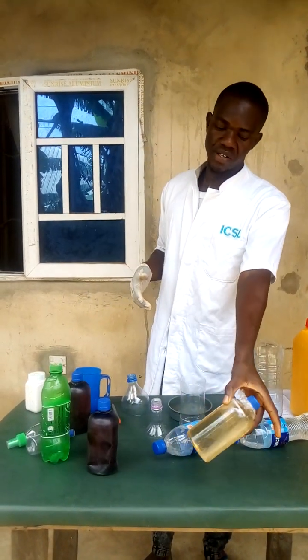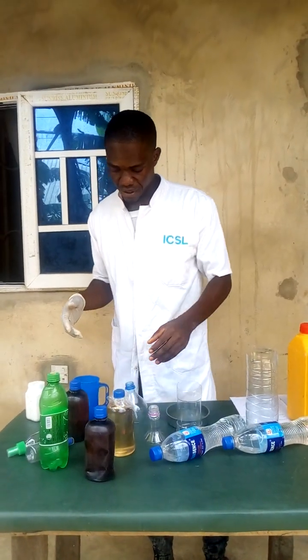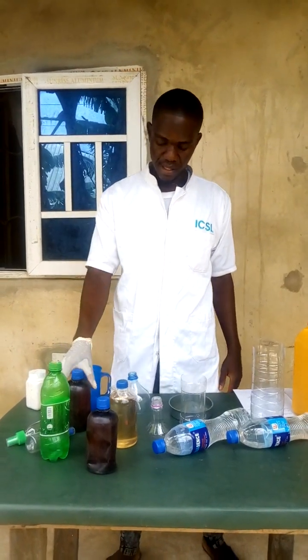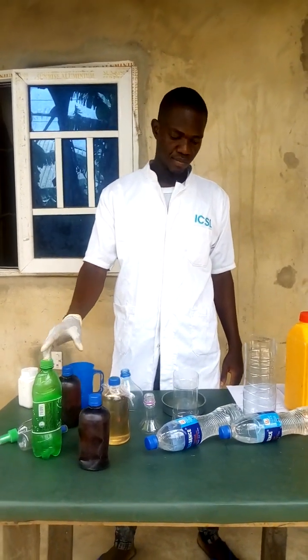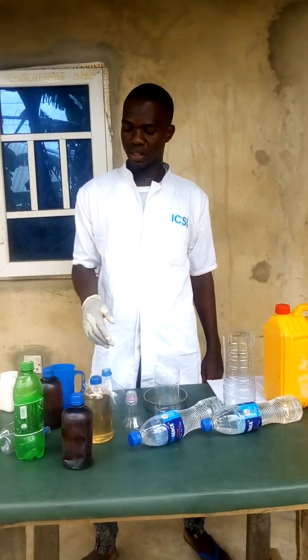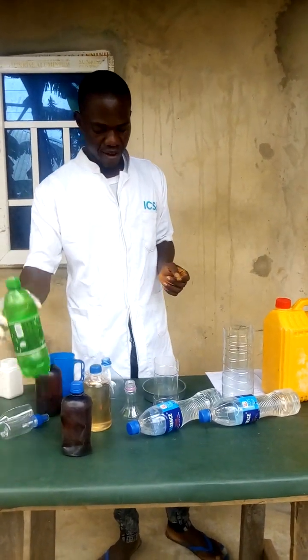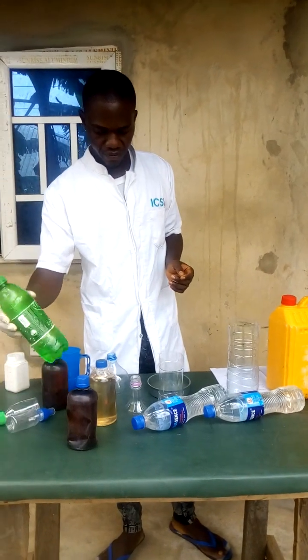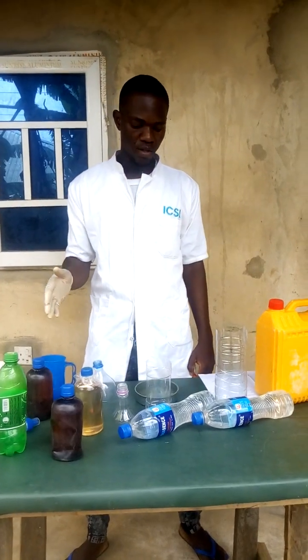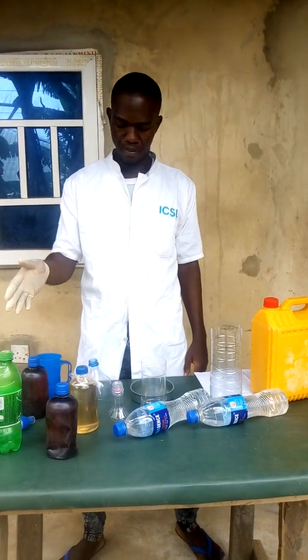So the glycerol is basically for skincare, and just a little quantity of it will be added. And then I have the hydrogen peroxide, also according to World Health Organization standards, which is just to help deactivate or make inactive bacteria in the solution. Other additives you may add, which of course are not compulsory, is my fragrance here. You can get the perfume fragrance, but most likely you wouldn't need to use this if you are doing it for a commercial purpose, because of allergic reactions associated to the use of fragrance.